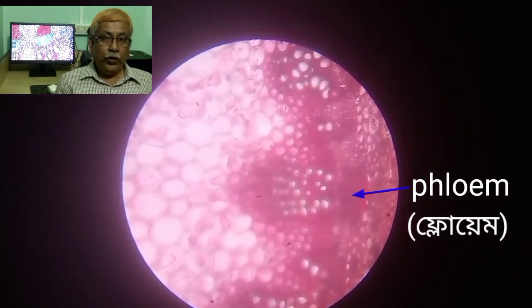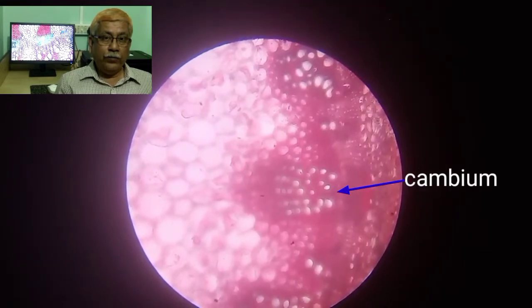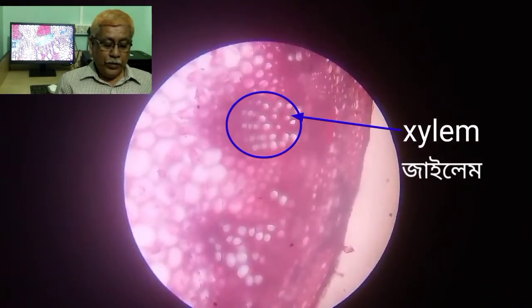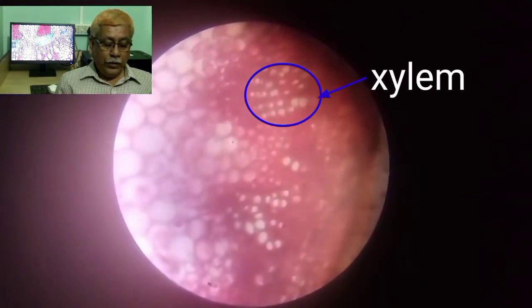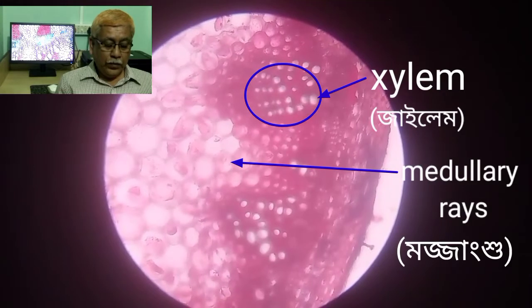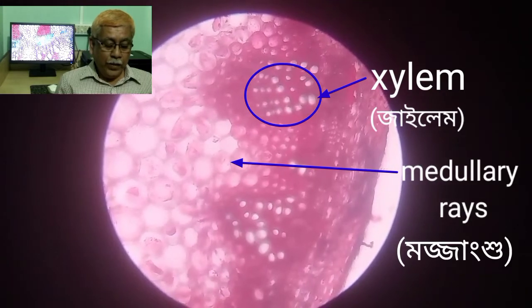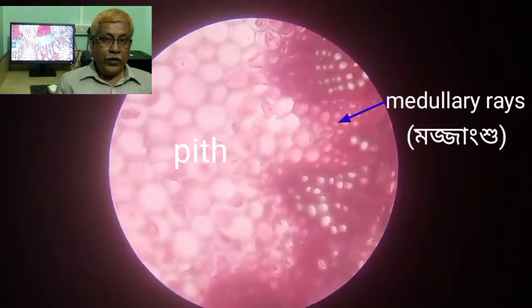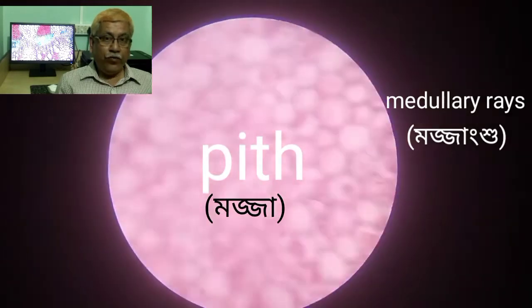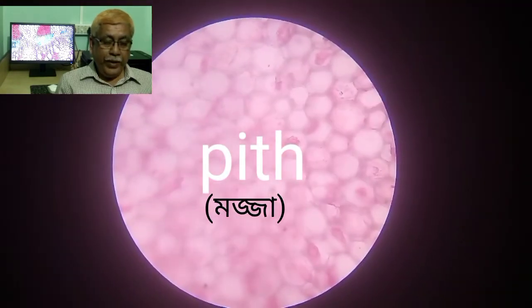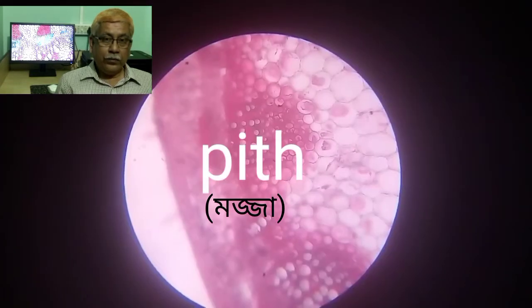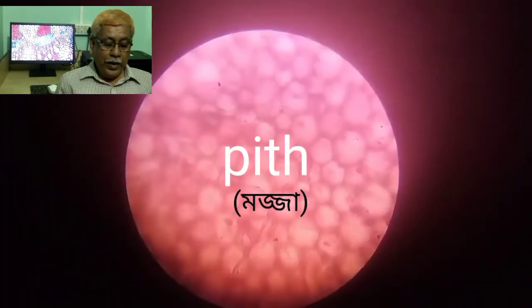Cortex and endodermis are visible. Now see the phloem tissue — phloem tissue is clearly visible. Now cambium. Xylem — xylem tissue is clearly visible. Medullary rays are seen. Medullary rays and pith. Pith region is clearly visible.